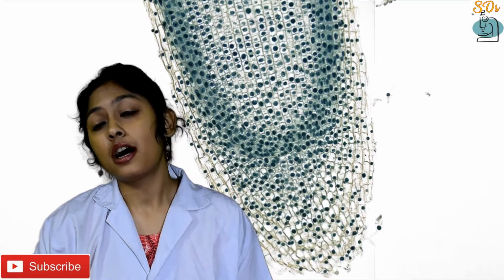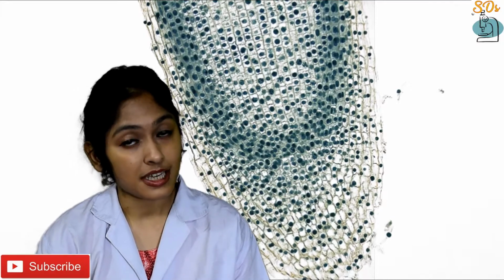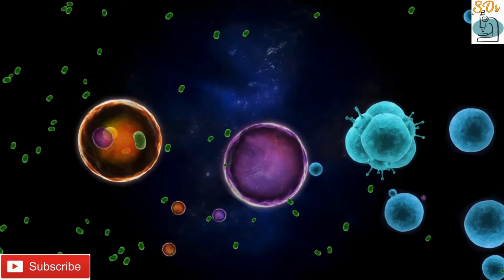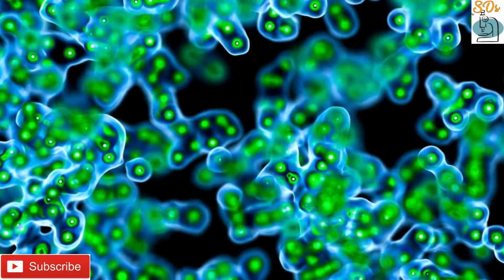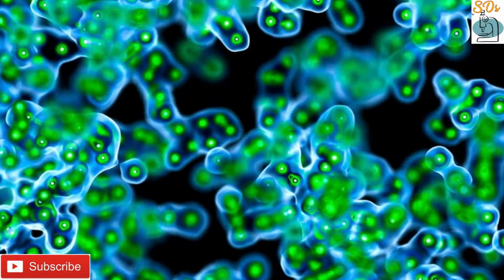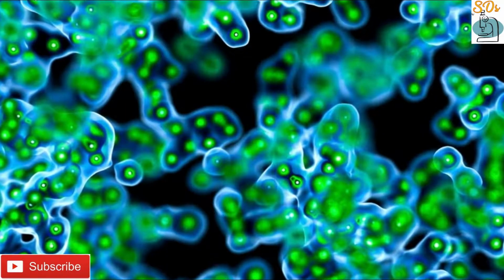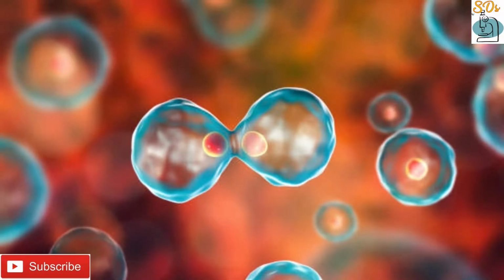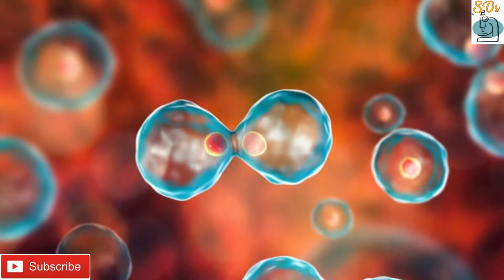Today I have come with an experiment technique of mitosis on onion root tip. We know all organisms are made of cells. For an organism to grow, mature and maintain tissue, new cells must be made. All cells are produced by division of pre-existing cells. Continuity of life depends on cell division. There are two main methods of cell division, mitosis and meiosis. In this tutorial, we will learn about only mitosis.